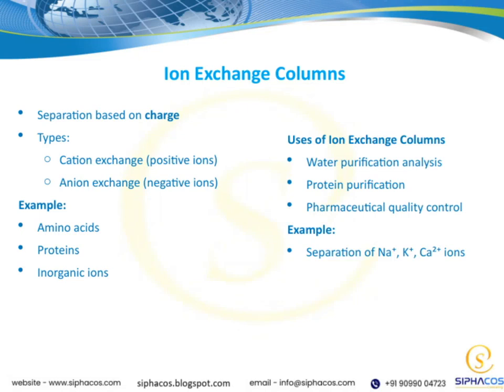These columns are incredibly versatile and are used in a variety of fields. For example, they play a crucial role in water purification analysis, helping us remove unwanted ions to produce clean drinking water. They're also essential in protein purification, where we separate specific proteins from complex mixtures. In pharmaceutical quality control, ion exchange columns help ensure the products meet strict standards by isolating or removing certain ions or molecules.